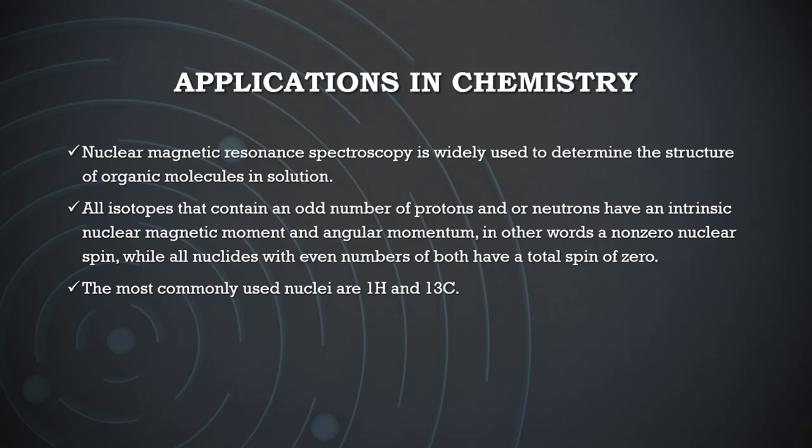Applications in chemistry. Nuclear magnetic resonance spectroscopy is widely used to determine the structures of organic molecules in solutions and to study molecular physics and crystals as well as non-crystalline materials. NMR is also routinely used in advanced medical imaging techniques such as MRI.